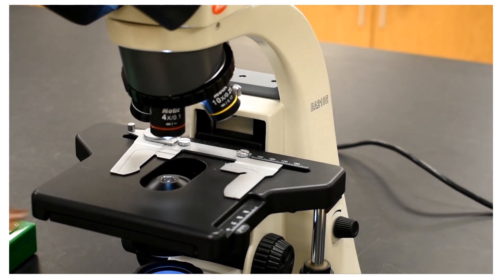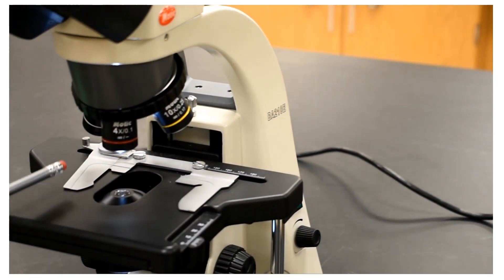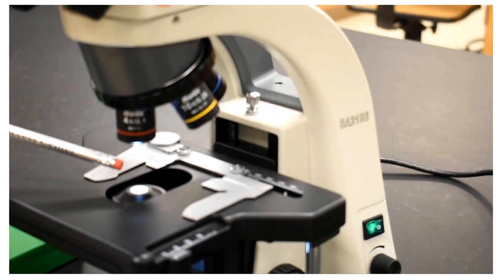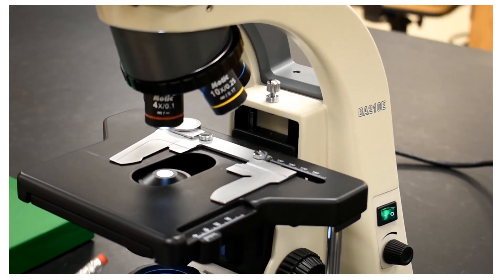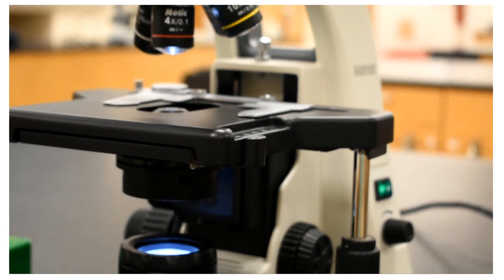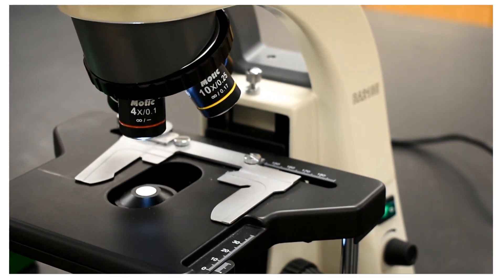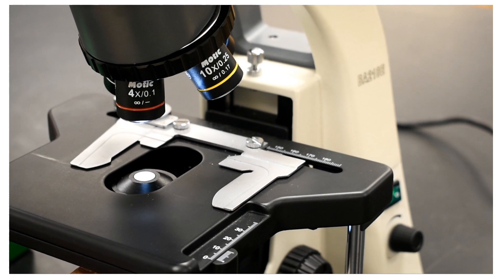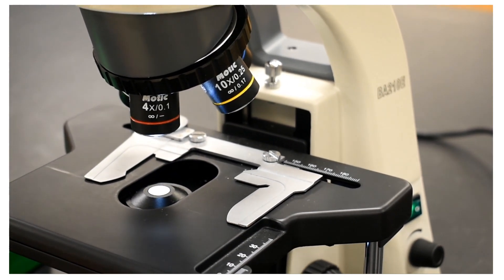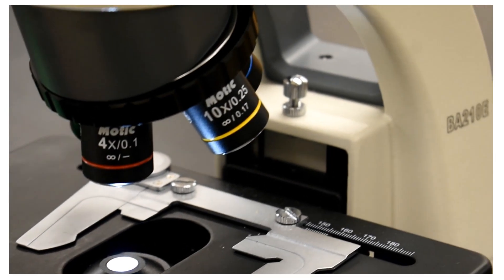On top of the stage there is the mechanical stage. Apart from the brightness control, we can also control the aperture of the light source using a knob called the iris diaphragm. When I move this lever, you can see that I am controlling the amount of light coming through the light source up to the stage. This is called the iris diaphragm.